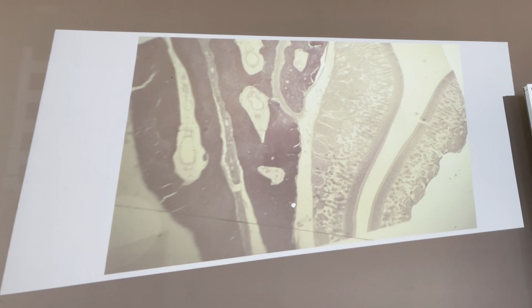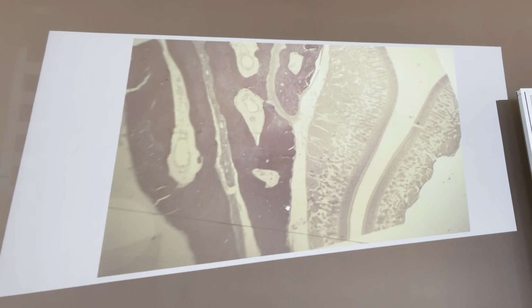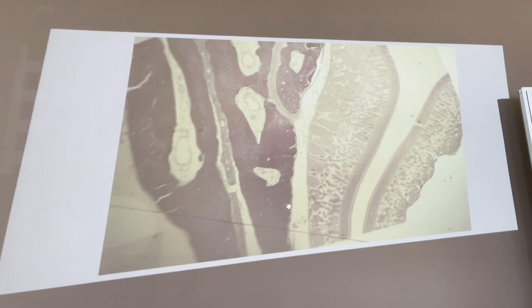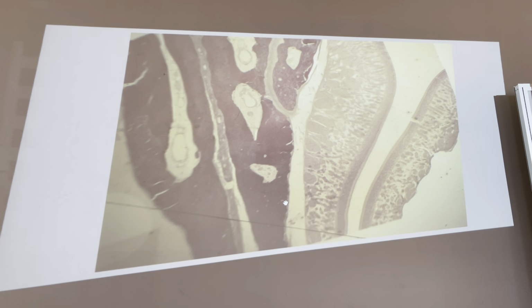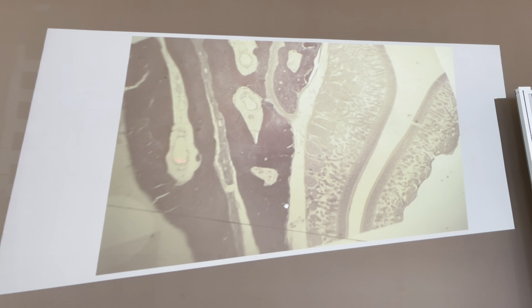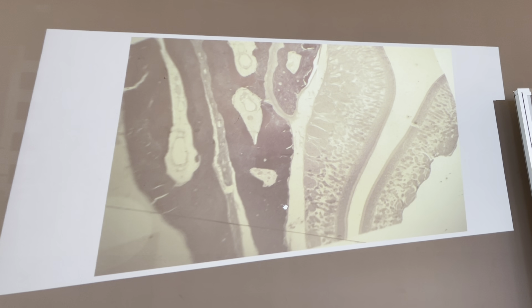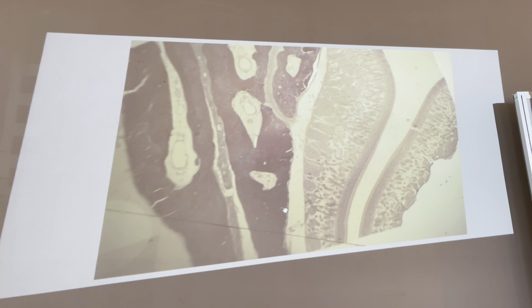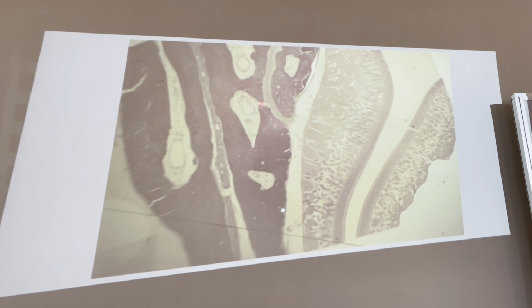Take a look. This is the bony part of the nasal cavity. This is the bone.